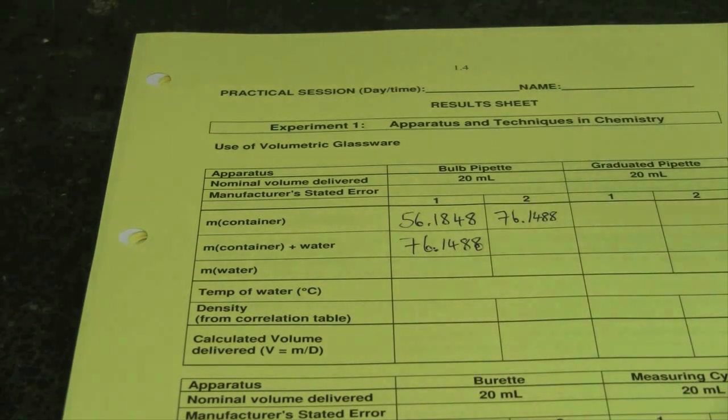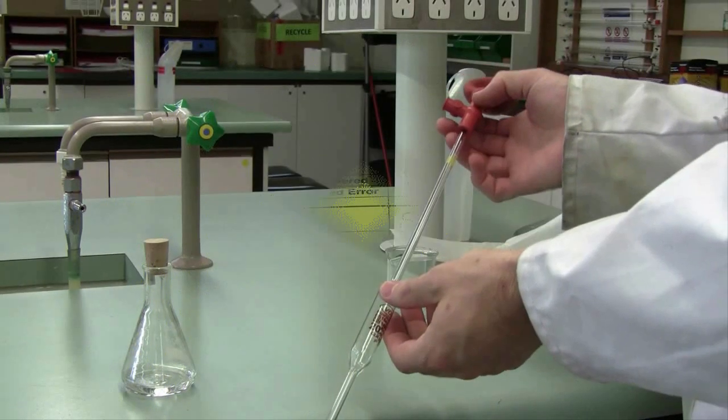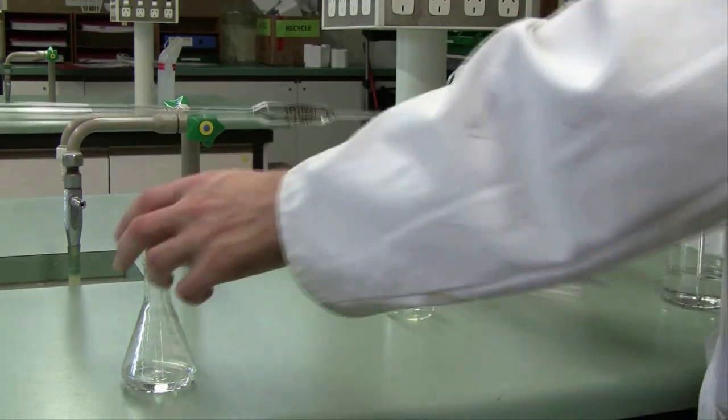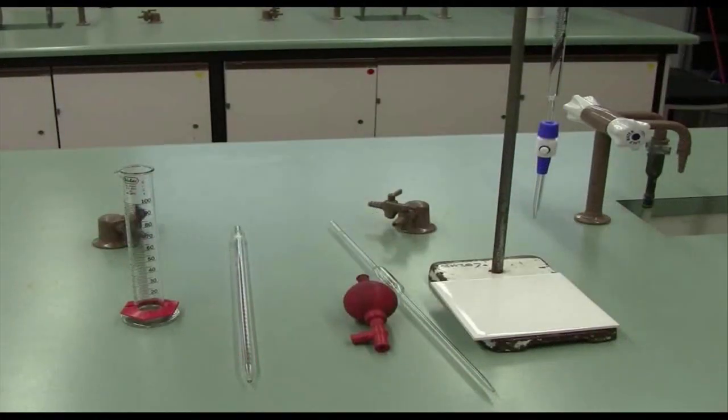There is no need to wash out your flask so here I can add my next 20 mls directly into the conical flask. So your task today will involve you adding 20 mls as accurately and precisely as you can using each piece of equipment shown here twice.